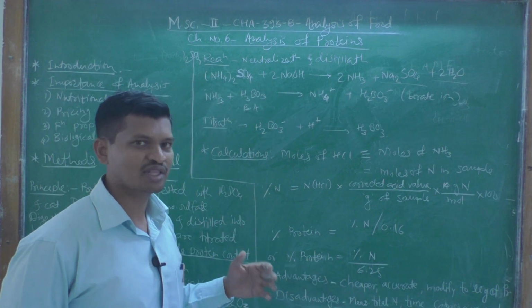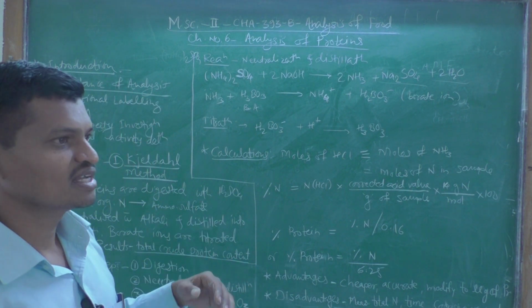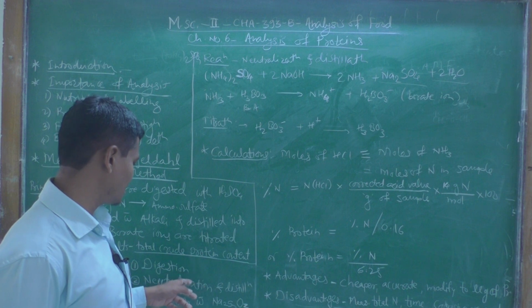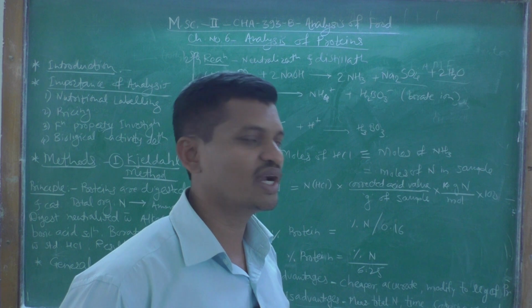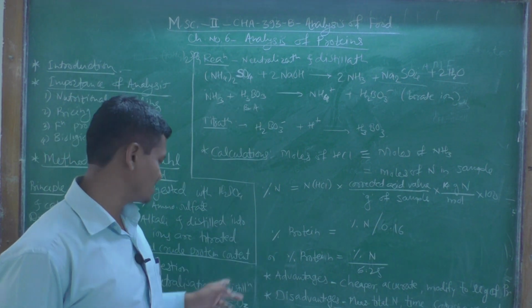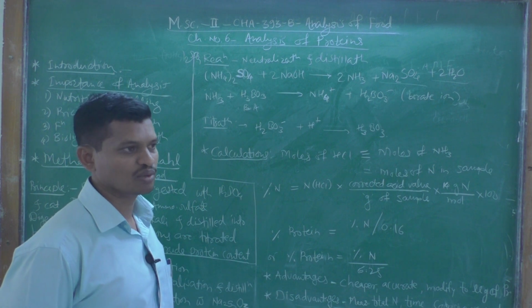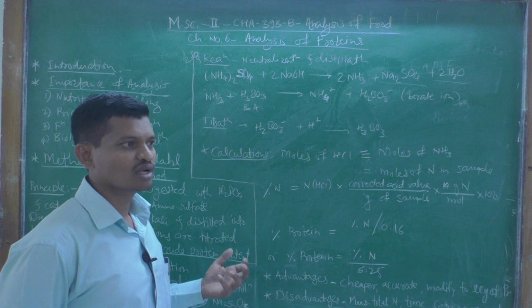This is the old method, in which sodium thiosulfate was used. In the old method, potassium iodide and iodate ions were used in the second step, so iodine is generated in the neutralization step, and the liberated iodine was titrated with sodium thiosulfate. That process and those reactions we have already seen in the lipid analysis.